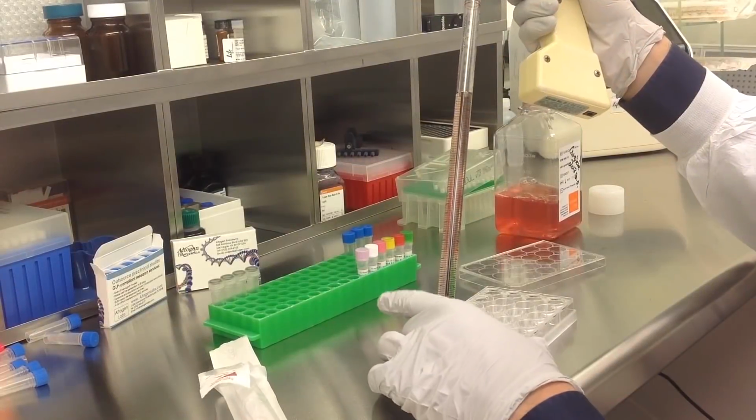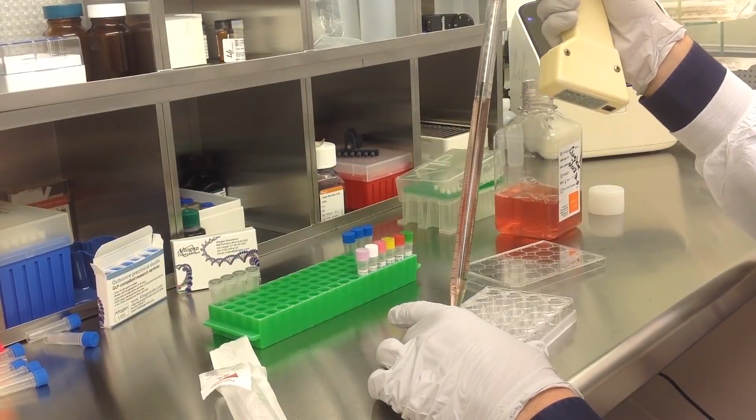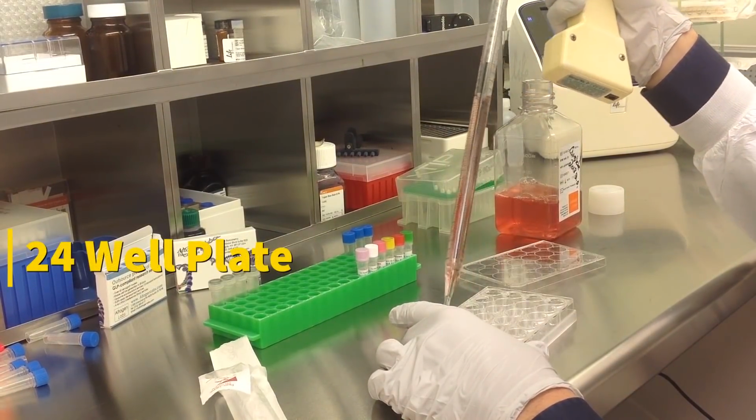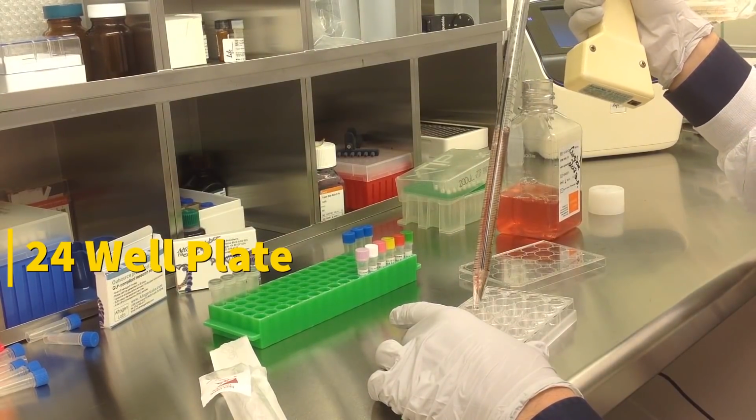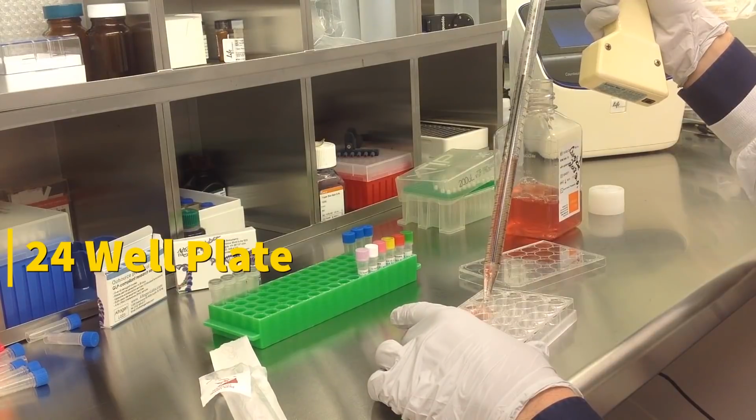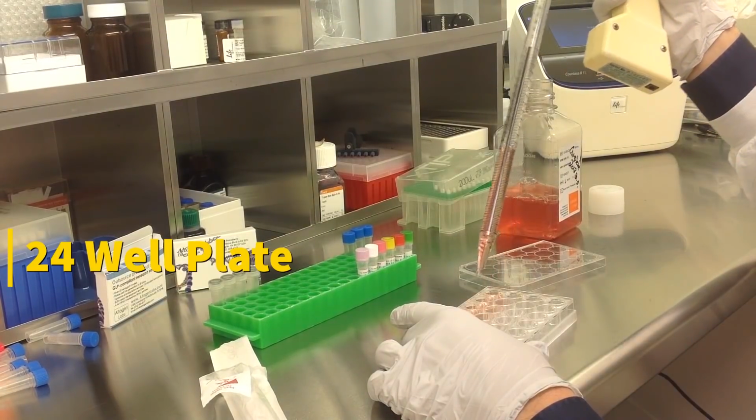Today we will be transfecting HeLa S3 cells obtained from ATCC. We will be using a transfection kit manufactured by Altogen Biosystems. In this tutorial, we use a 24-well plate. Transfections can be scaled up or down based on plate surface area as described in the corresponding transfection protocol, which can be found at altogen.com.